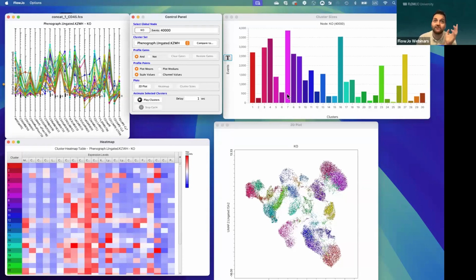You know, phytoplankton can have different fluorescence background. It could be something you can try, but ideally, if you have more detail or more parameters like image-derived features like eccentricity, radial moment, max intensity, you will have an even better result with those clustering tools compared to only the autofluorescence of the different species.